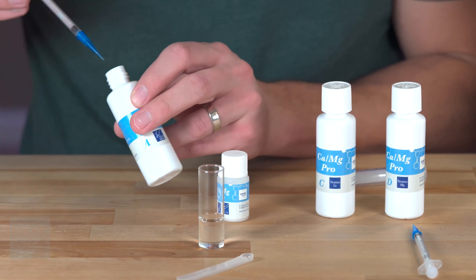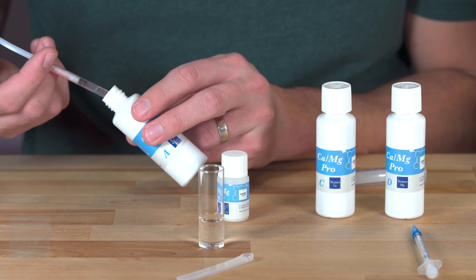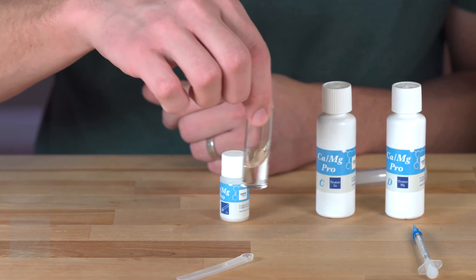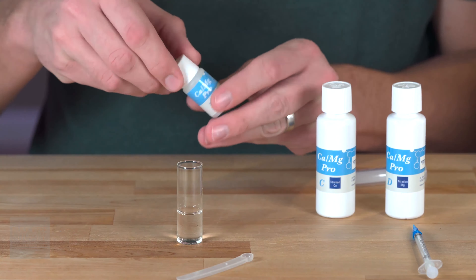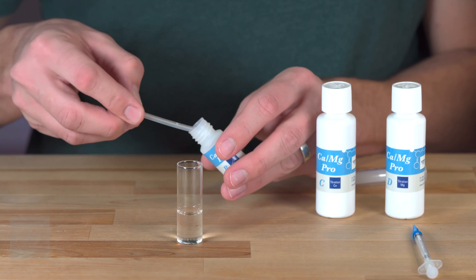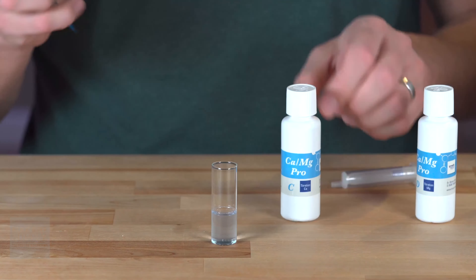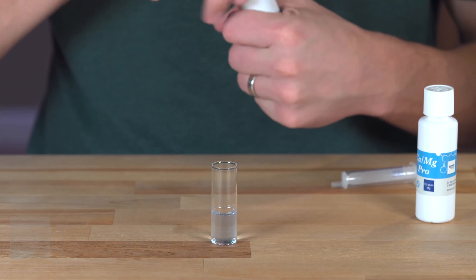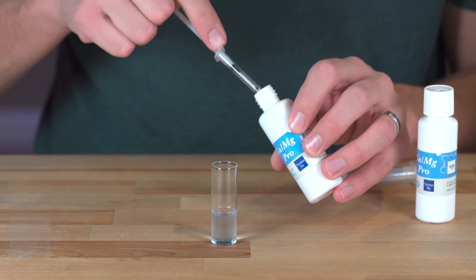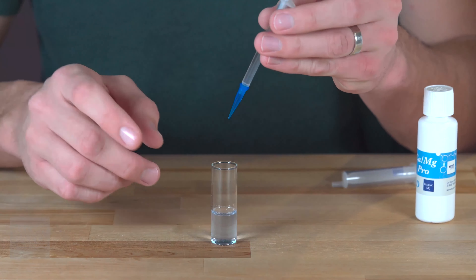Cuvette B is just for reference, so that's not going to get tested at all — it's just to reference against your tank water. Cuvette A is the one we are going to test. We'll take 0.5 milliliters of reagent A, going by the black stopper — there will be a little air pocket in there and that is totally normal. Add all of this into cuvette A and briefly swirl the solution. Now we're going to take reagent B, which is a powder and will turn our liquid blue — add one flat spoonful and dump the entire contents in. Our solution will turn a light blue. The third step is to draw one milliliter of reagent C into the syringe and add it drop by drop until our solution goes colorless, swishing in between.